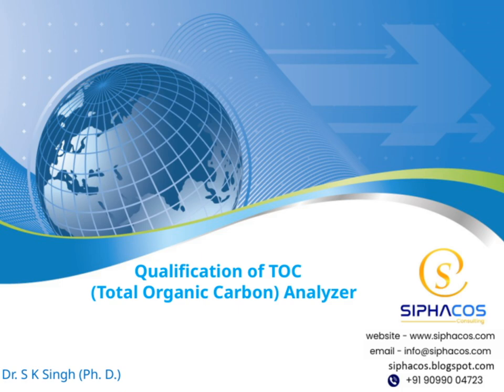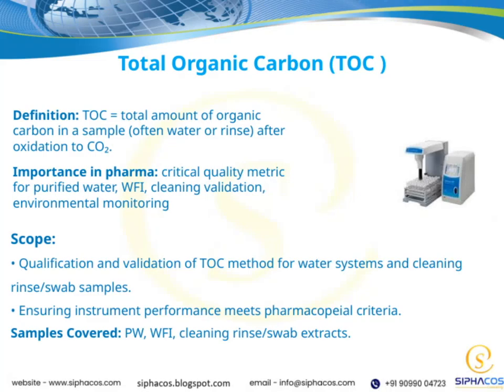Let's get started. In this slide, I want to walk you through the scope of our project. First, we're focusing on the qualification and validation of the TOC method, specifically for water systems and cleaning rinse or swab samples. Our goal is to ensure that the instruments we use perform reliably and meet the criteria set by pharmacopoeial standards. We are covering different types of samples, including purified water, water for injection, and rinses or swabs from cleaning processes. These samples are critical because they can directly impact product quality and safety.